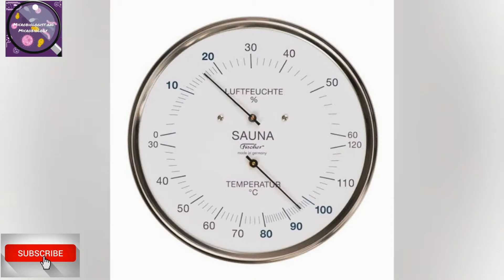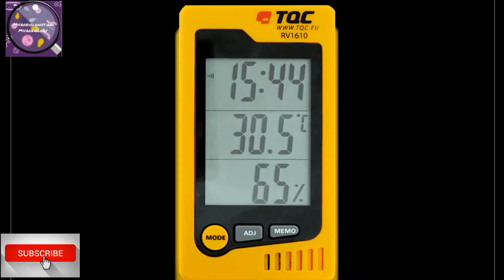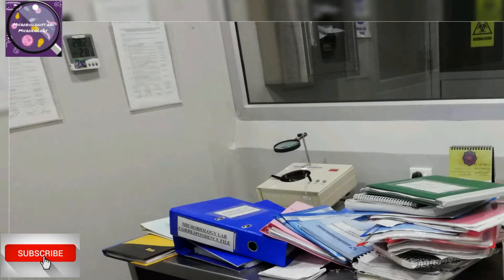There are different kinds of thermohydrometers or hygrometers available in the market. You can find digital or analog hygrometers easily available. In our microbiology lab, we are using a digital thermohydrometer, as you can see in the picture.